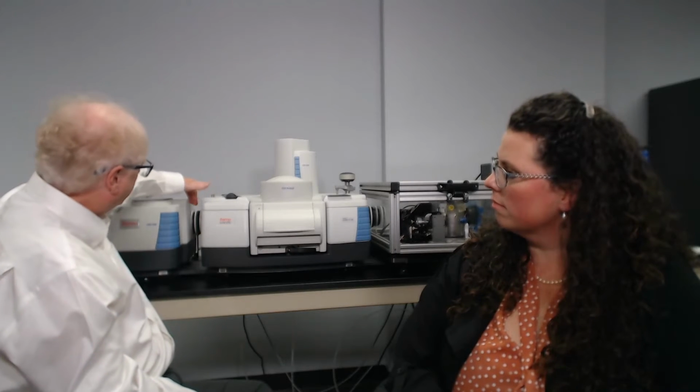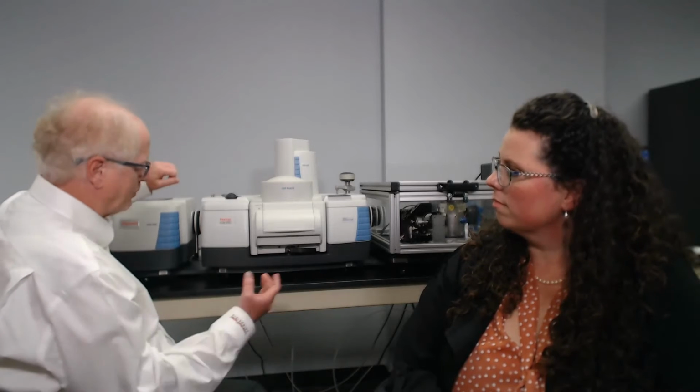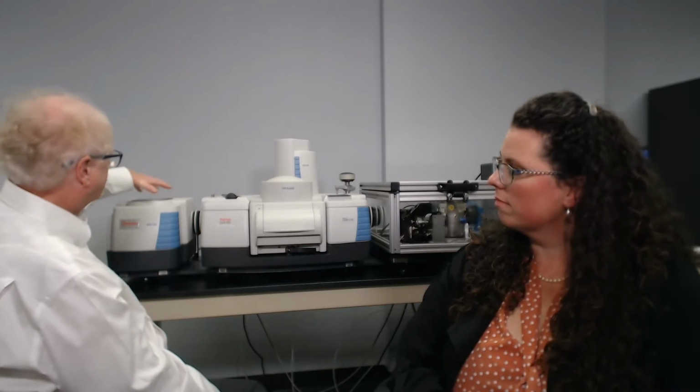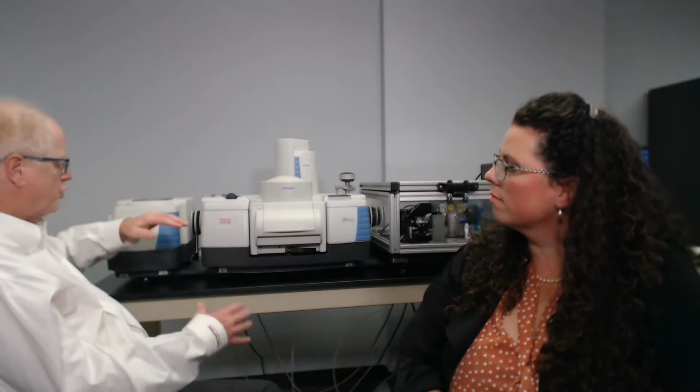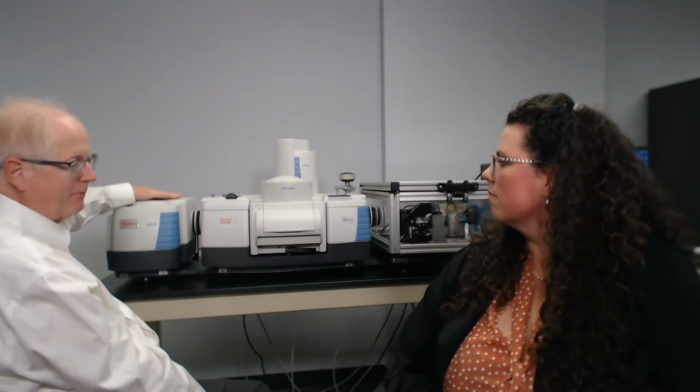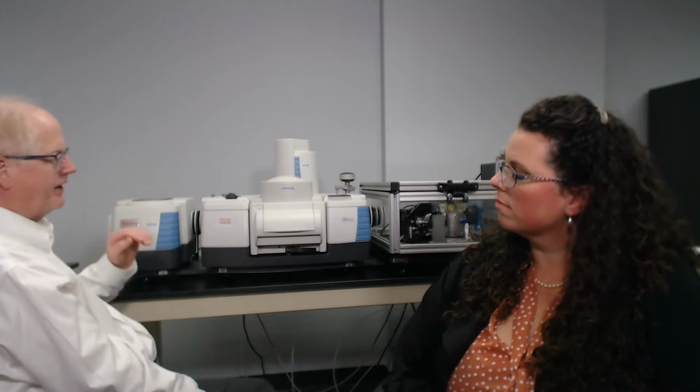This one right here, the closer to us port, is used for a collimated input beam, or output beam. In this case, we have a near-infrared module attached to the side. Now this near-infrared module has built into the top an integrating sphere with the usual sphere underneath it and a gold mirror allowing us to do the backgrounds. So you just put a sample on top and it does essentially diffuse reflectance. It also has on the side of it connectors for fiber optic connections so that you can have a probe.